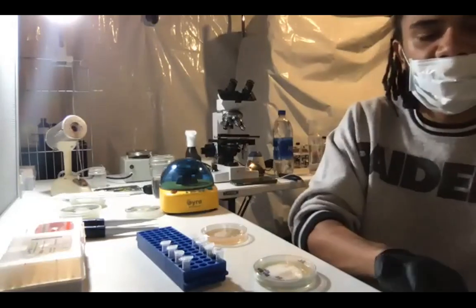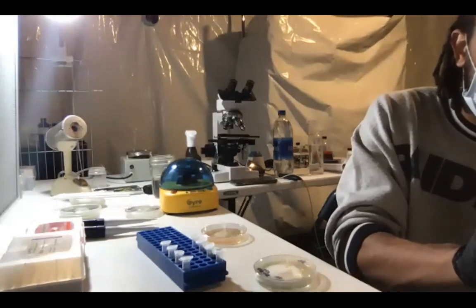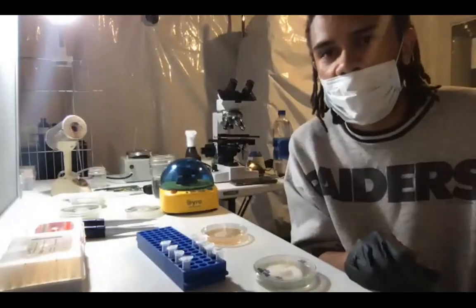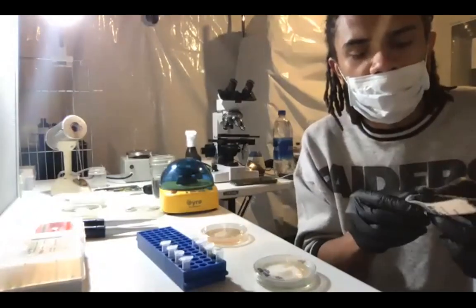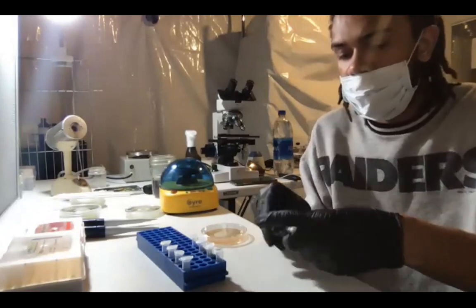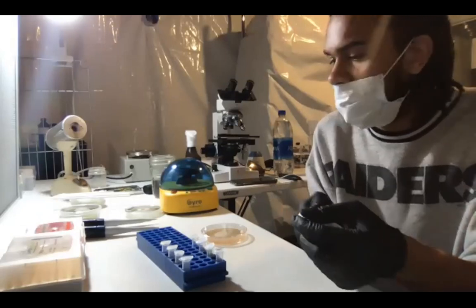So the primers that I'm using are specific for Cordyceps militaris mating type 111 and 121. And I'll email you guys the sequences so you can get them synthesized. There's nowhere that I found that sells these primers already mixed for you, so you're going to have to order them from any laboratory company that can synthesize DNA for you. And they're typically going to come 10 times too strong for a reaction, so you're going to have to dilute it, which we'll do during this demonstration.